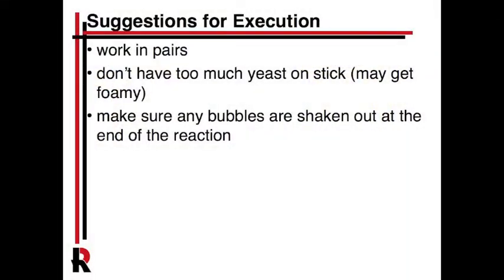All right, so we're going to work in pairs. Again, don't put on too much yeast. You only need a few. It's a very vigorous reaction. Then make sure the foam is broken up before you stop measuring everything. If you have to tap it or give it a little shake, do anything where you can still maintain the seal of the reaction, and if you have a siphon going, keep the siphon going. Keep that seal intact, but try to get rid of as many bubbles as you can.